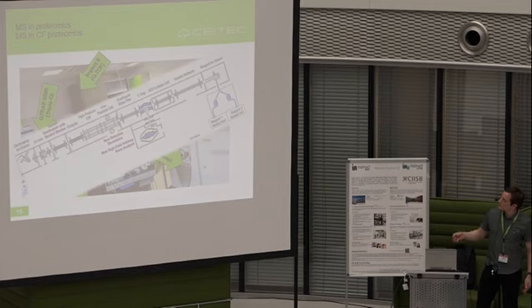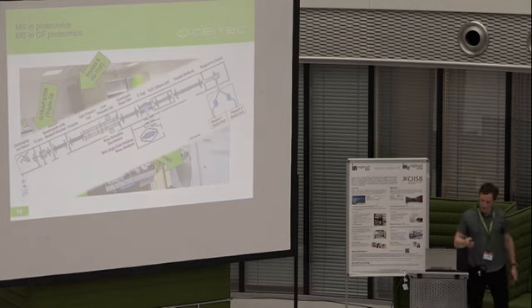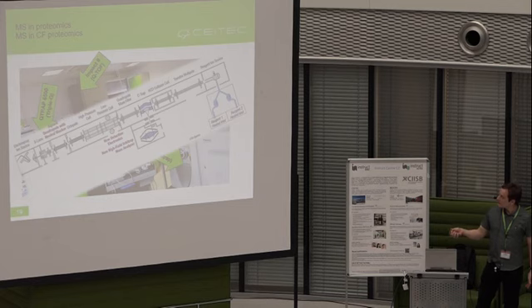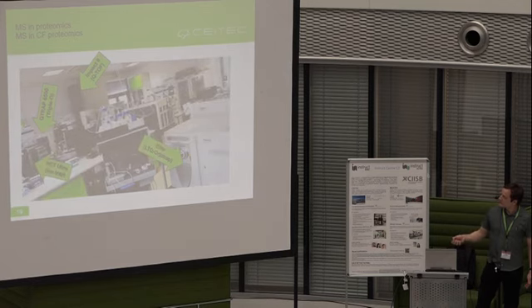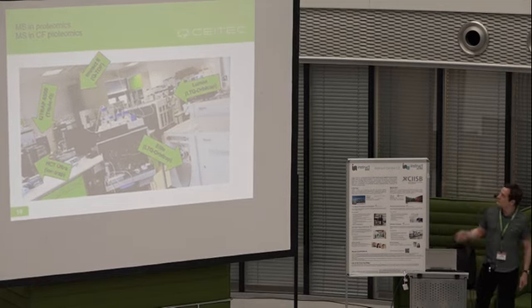You can choose how the ions, from the moment when you ionize them by electrospray, will be treated with the aim to obtain maximum information desired from the system. As too many samples arrived, we needed another Orbitrap, because with time the quality of the ion optics is improving, so this instrument is faster and more sensitive. And we found that two are not enough.